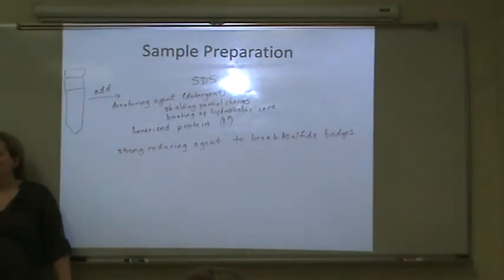You said the strong reducing agent breaks what? Disulfide bridges between cysteines.